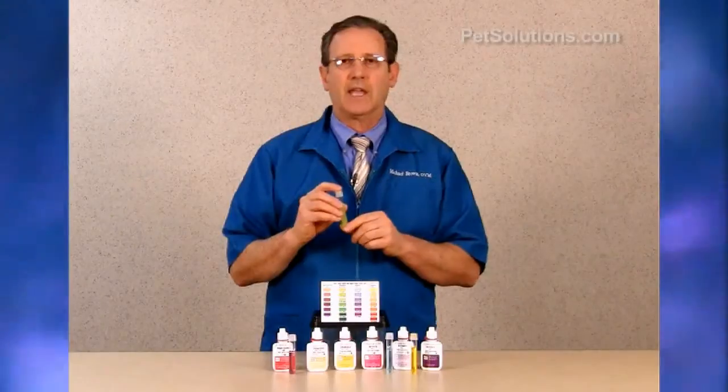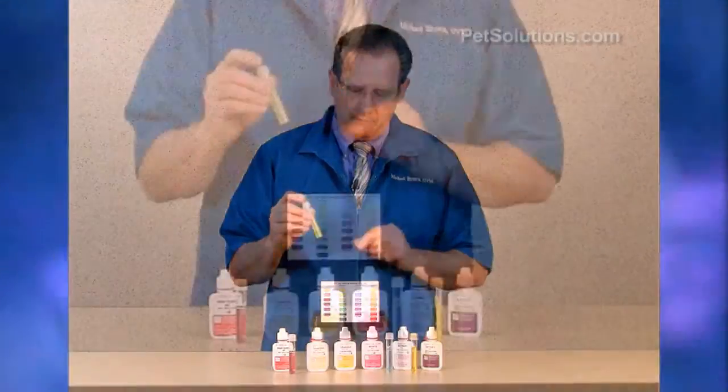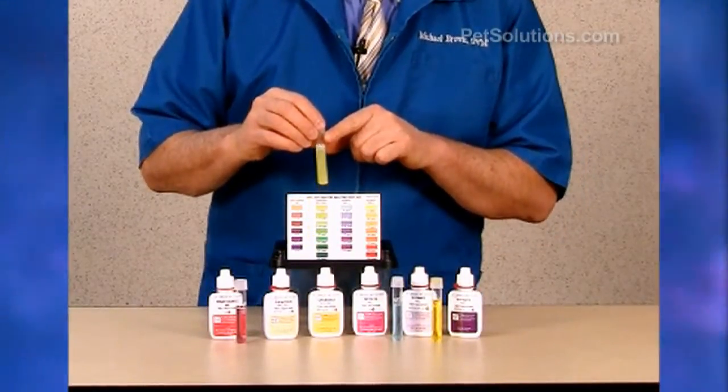Don't put your finger over the edges as this can affect the results of the test. Wait 5 minutes for the color to develop, then compare it to the color chart. This has 0 parts per million of ammonia, which is excellent.